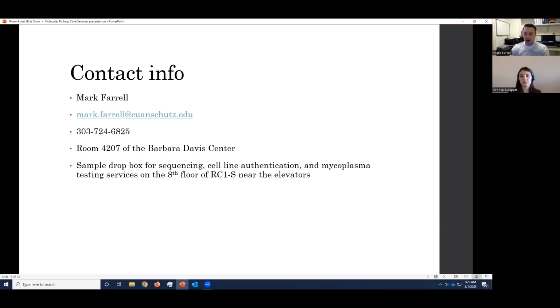So those are our services. Again, here's my contact info. Mark Farrell, 2 R's, 2 L's with an E in between. The phone number for the lab, the room number is 4207 in the BDC. And again, we have our sample drop box in RC18 on the RC1 South on the 8th floor near the elevators for sequencing, cell line authentication, and mycoplasma testing services.